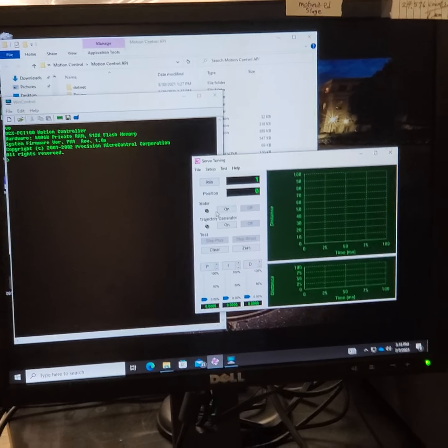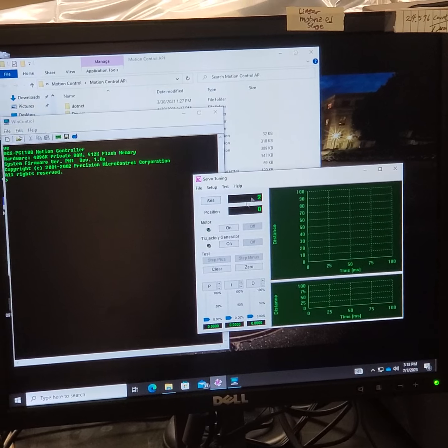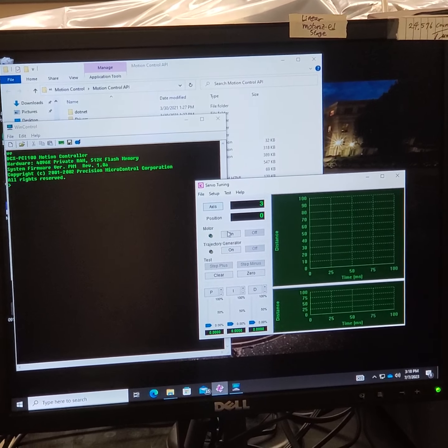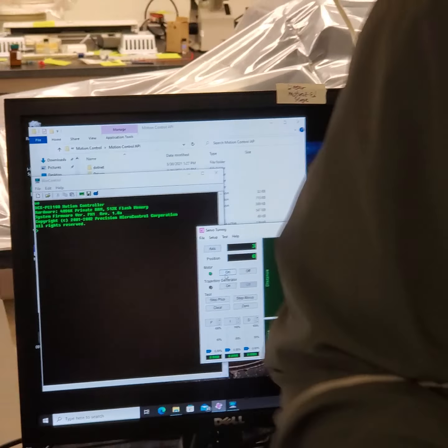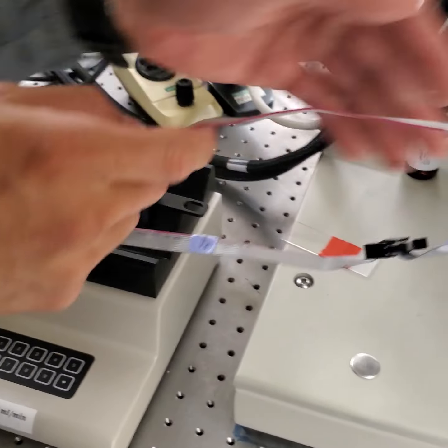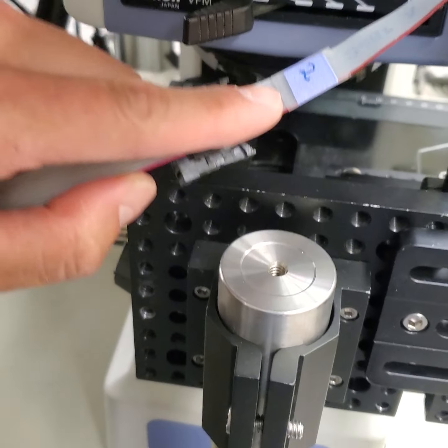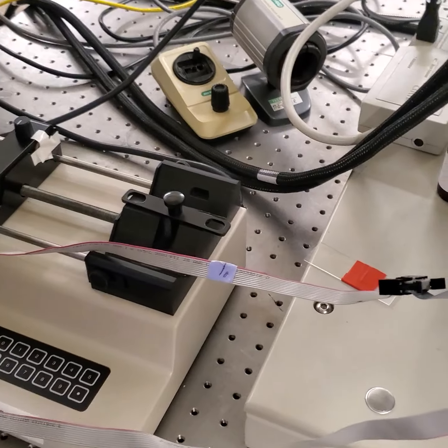You can power on and off axis 1, 2, and 3. That means axis 1 and 2 and 3, I labeled those here. 1 and this is 2, and we don't really use number 3, but it is here.